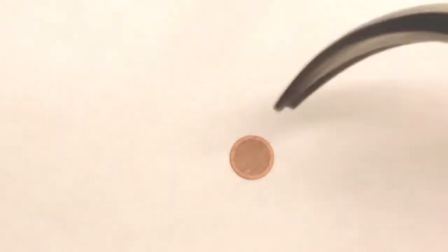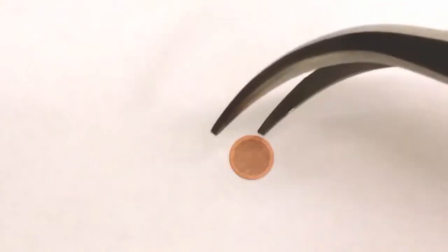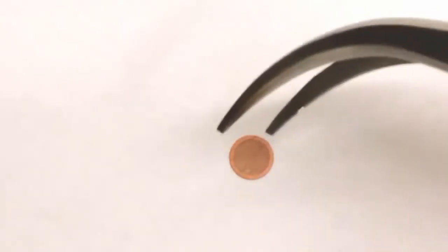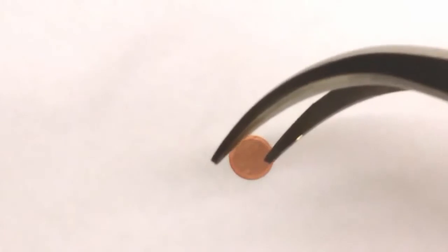Very tiny little dish. This dish is sort of 3 mm across. Here you can see the metallic dish in a much higher magnification. This is my tweezer again. As I said before, the diameter of this is 3 mm across. And you actually can see, perhaps in this movie, that there are small holes in this mesh. And the size of those holes is determined by the mesh number. So you can buy grids of different hole sizes.